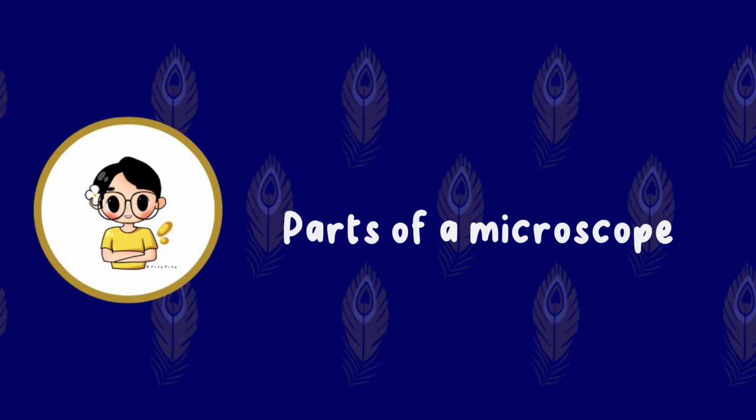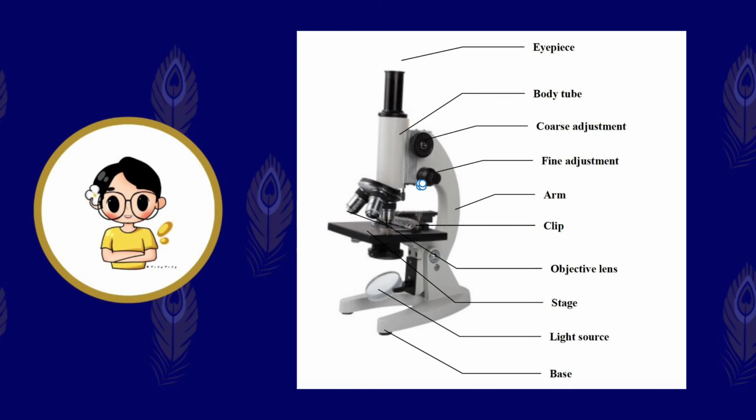Now let's learn the parts of a microscope. Eyepiece: the user looks through it to see the magnified specimen. Body tube is a part that joins the eyepiece and the objective lens. Coarse adjustment: we use it to raise and lower the stage more rapidly.